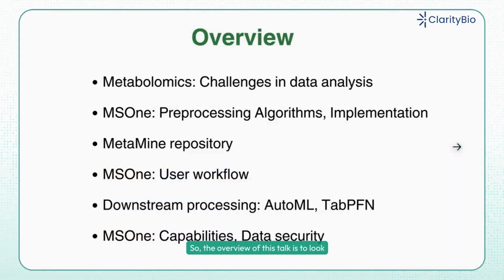this software. So the overview of this talk is to look at challenges in metabolomics data analysis, how MSOne was developed, what are the algorithms, how is the implementation. We have analyzed over 100 public domain data sets and placed them in a repository called MetaMine.